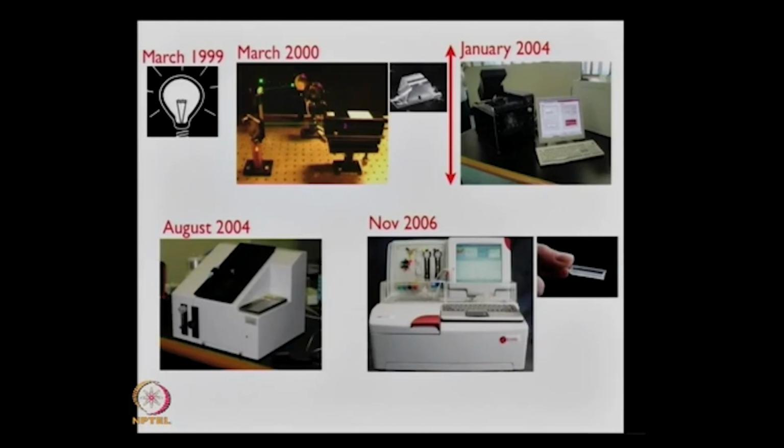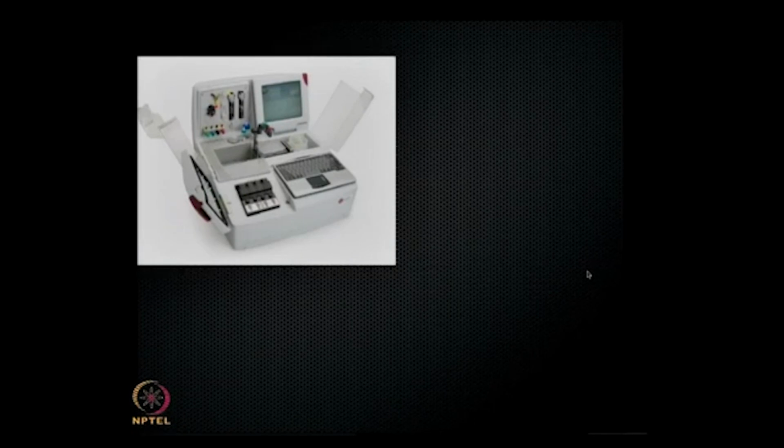And that little piece of double-sided sticky tape, it's not really going to be good for you to have to make that yourself. It's now a little piece of plastic that's actually a lot cheaper. It took a lot to get there, but it's now much more efficient and cheaper. Okay, so here's the instrument. It's all computerized. There's a pumping system inside. There's software.